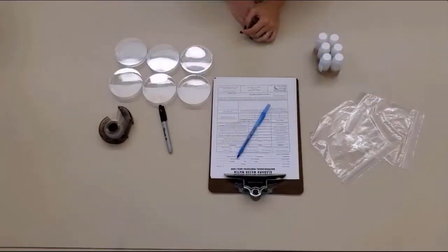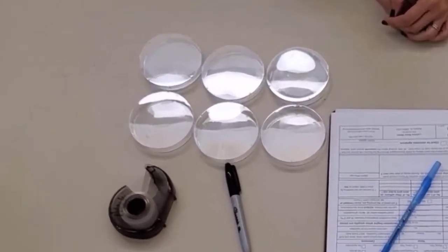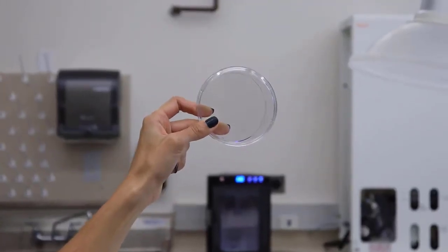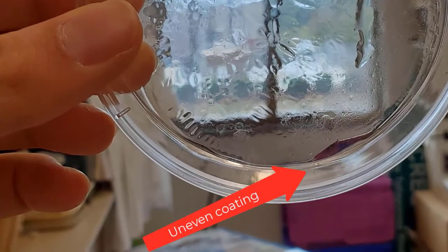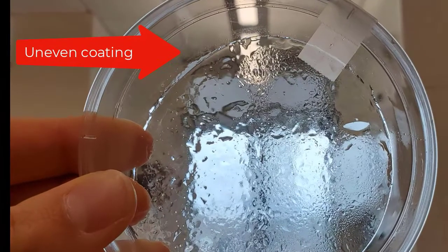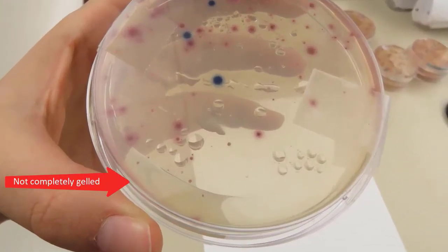Before we leave for sampling, we are going to prepare our Petri dishes. Here we have 6 Petri dishes, 3 for each of our 2 sites. To begin, we always suggest that you examine each Petri dish for irregularities, including uneven coating of the bottom dish. These defects can cause problems with your test. For example, if the dish is not completely coated, your sample will not be able to gel properly.